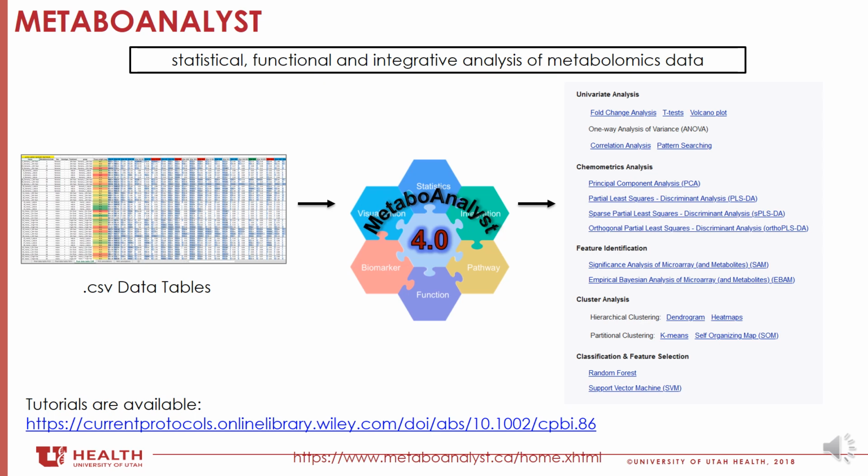Note that MetaboAnalyst is designed for analyzing large numbers of samples. Very few samples, like less than 10, will cause some functions to work improperly. Users receive data tables formatted for use in MetaboAnalyst, as well as instructions on how to get started.